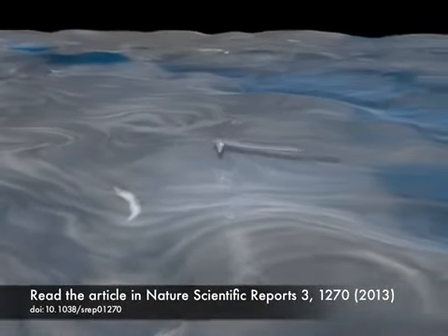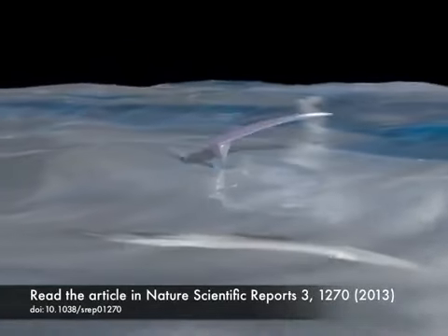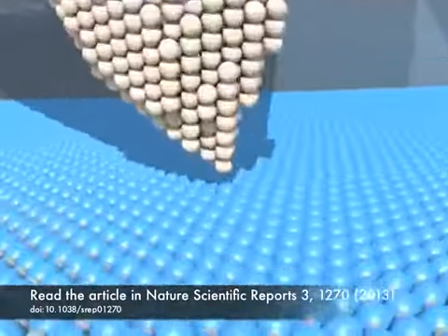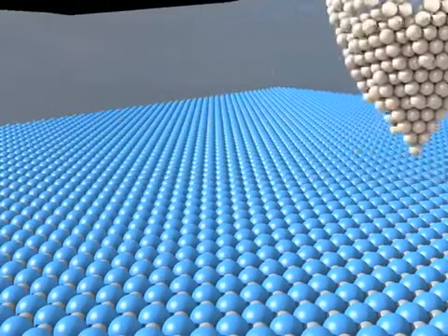An atomic force microscope, AFM, works so that a very sharp tip, atomistically sharp even, is brought close to the surface being studied. When the tip is just a few angstroms away from the surface, it can feel a nanoscopic force, and an image of the surface can be obtained by scanning with the tip.